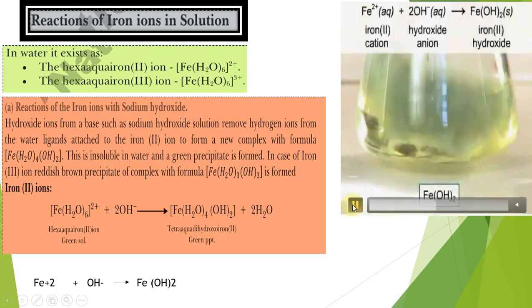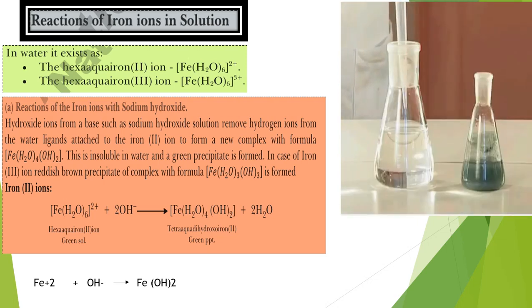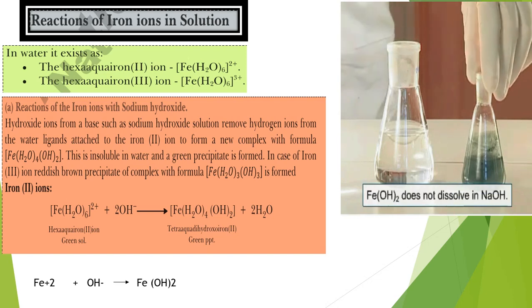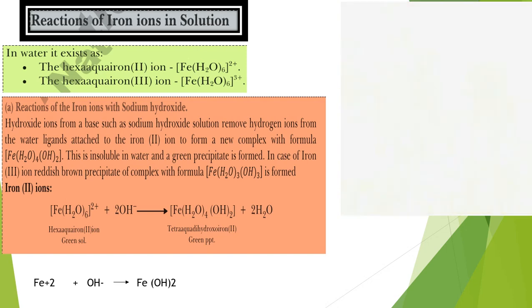Now, this Fe(OH)2 is insoluble in water. If we add more NaOH solution, it cannot be further dissolved. It means that it is insoluble in water. You see, it cannot be dissolved.